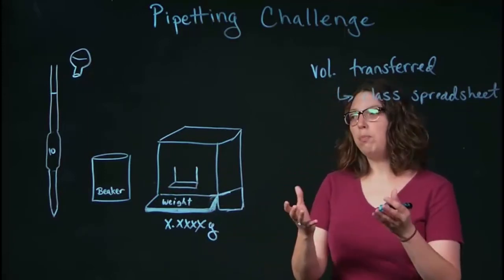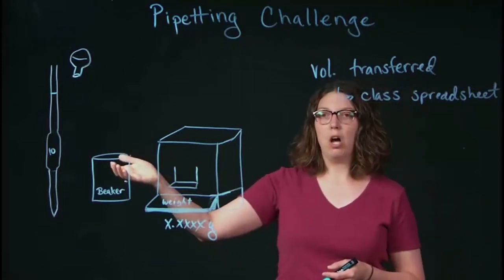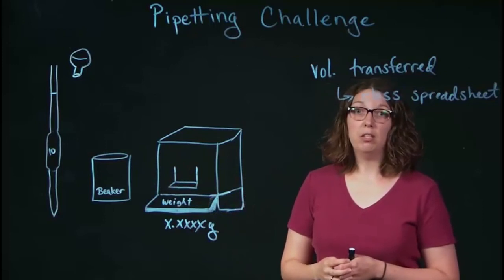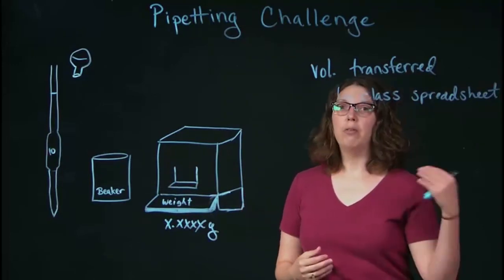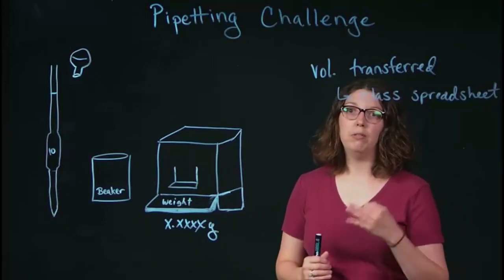So if you pipette and your volume transferred is within the tolerance of the pipette, great. Now repeat that two more times to be able to have a total of three really good measurements.